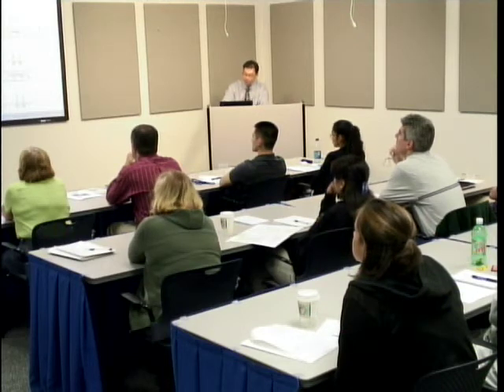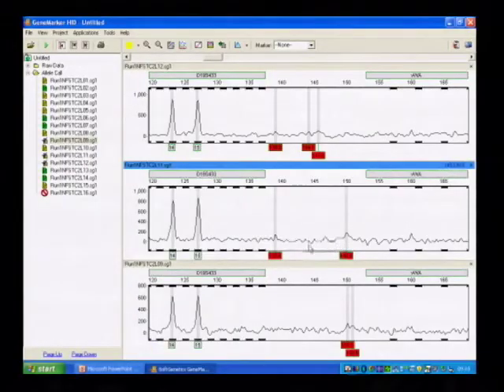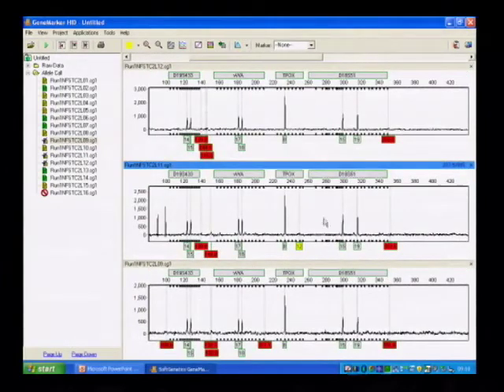All the alleles are being called. For the yellow trace, the alleles are called, and the software is picking up spurious, just noise spikes on the baseline. You see that more in yellow than the other colors. Is there a reason behind that? Yes, that's right. The yellow dye from the AB kit is weaker, so what ends up happening is that we detect less signal from it and more baseline.